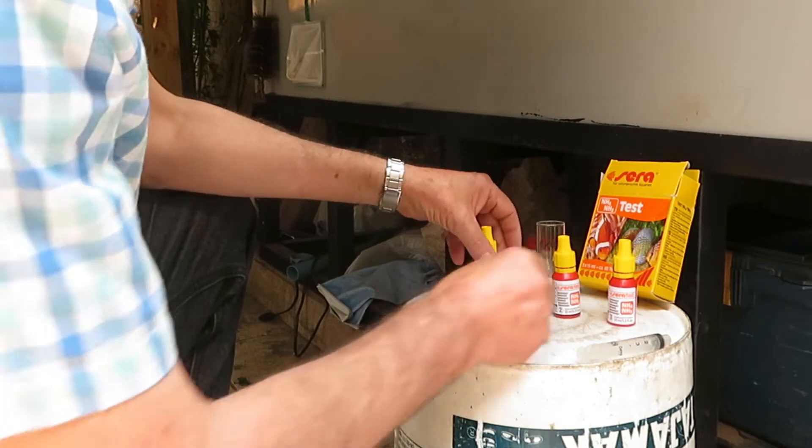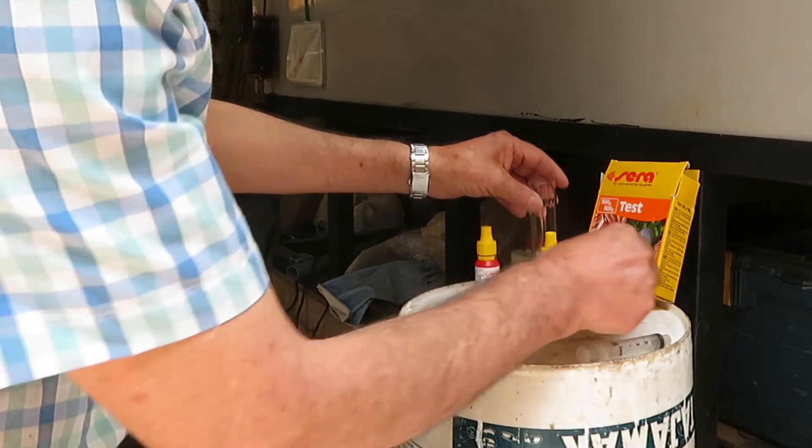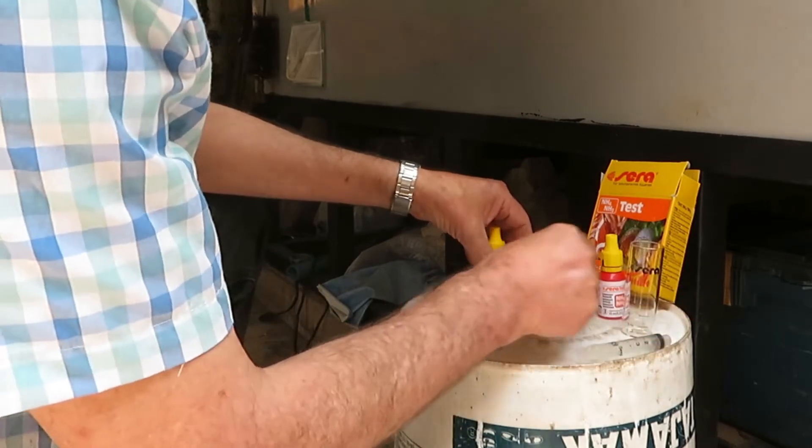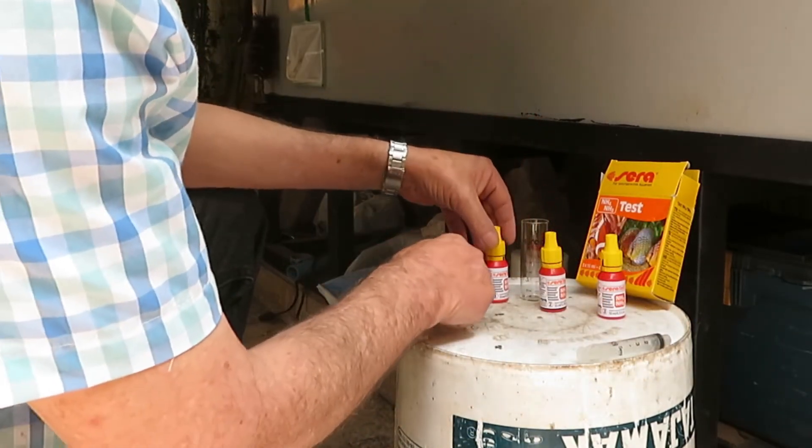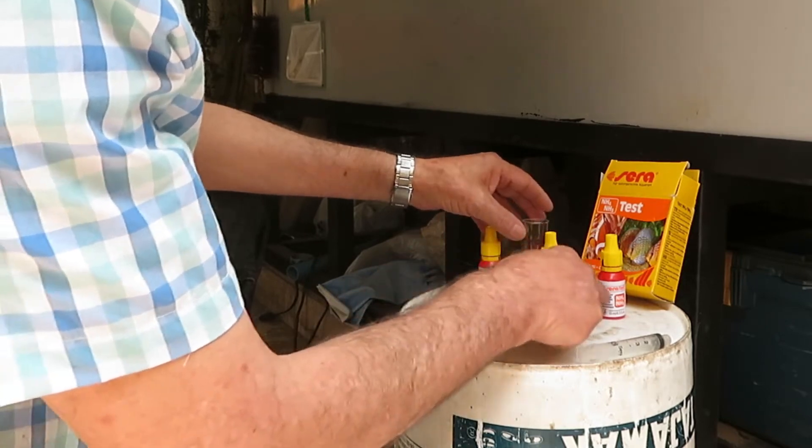We must keep these bottles on our workspace in the proper order so we don't get them mixed up — first we use bottle 1, then bottle 2, then bottle 3.